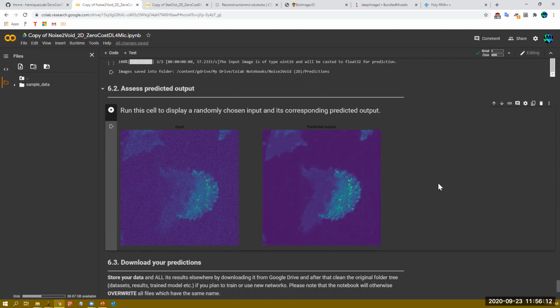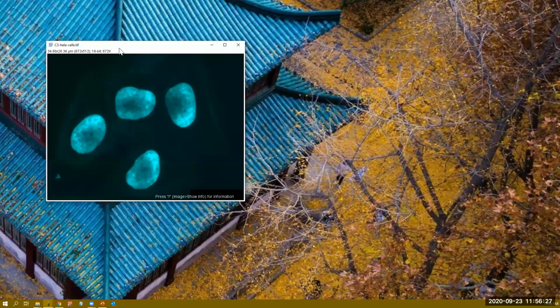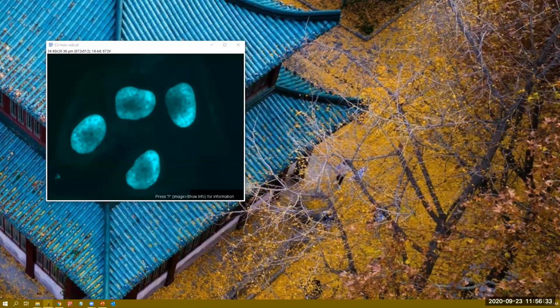So the last thing I'll show you before we end it off is DeepImageJ. Again, I've kind of pre-trained something. Well, I'll run it live because it doesn't take too long. So I'll have to drag everything here. It's not going to take too long.